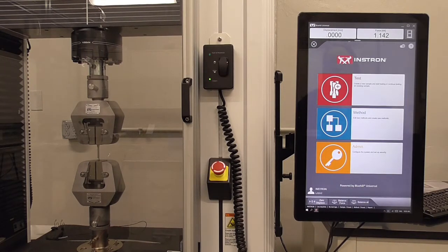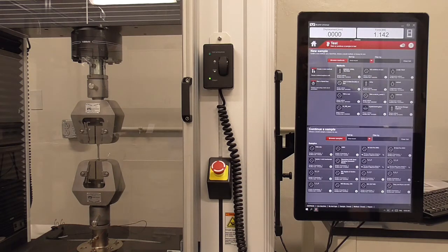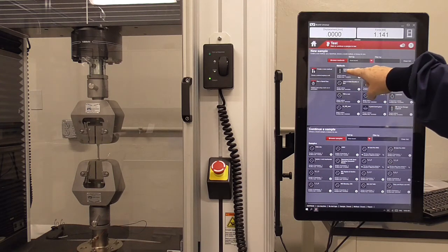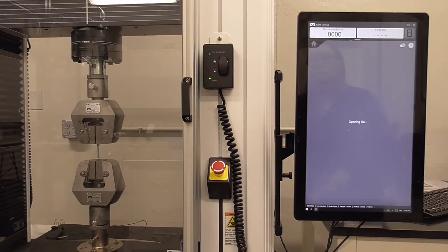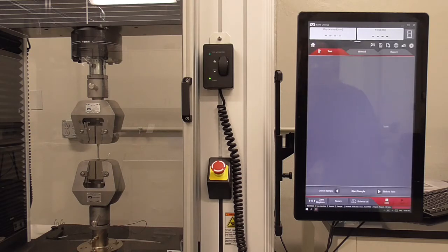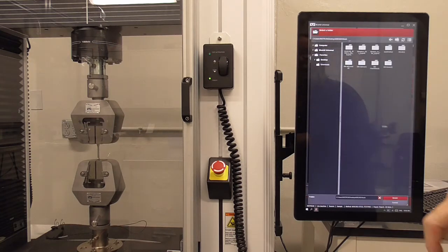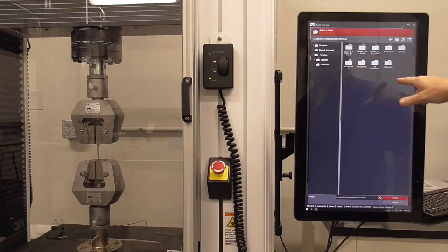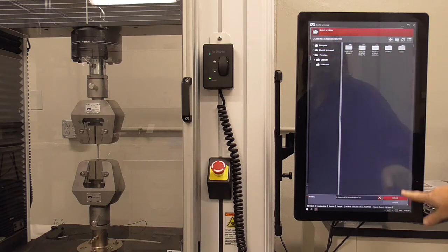To start a test, we are going to choose the test. This is the first page where it wants you to choose a method to run. We already have a method created for the lab — MSE 202 steel testing — so I'm going to choose that and it will open up the method. The first thing that comes up is where your data will be stored on the desktop.